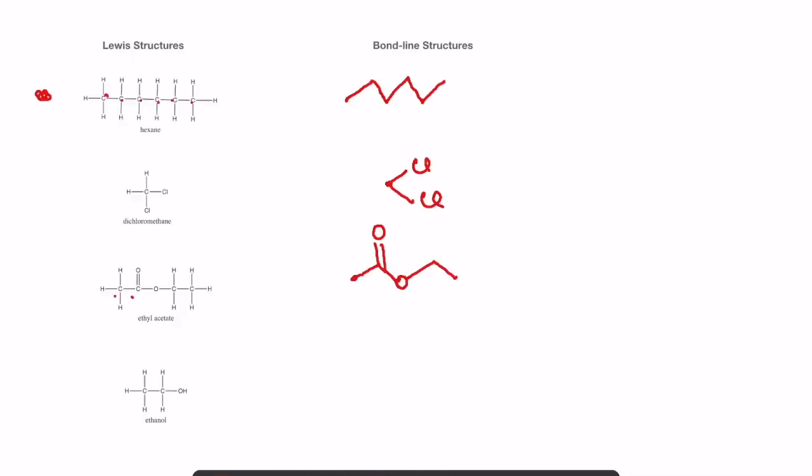Okay, I forgot to mention that these are the liquids that you're using in the experiment today. These are your solids: benzoic acid, naphthalene, 2-naphthol, and phenol. And these are all what are called aromatic compounds, which you'll learn a lot more about as you go through the course.